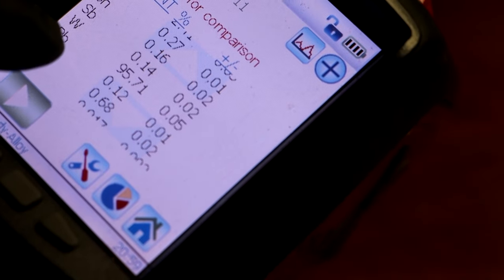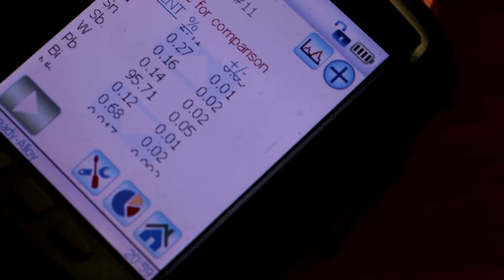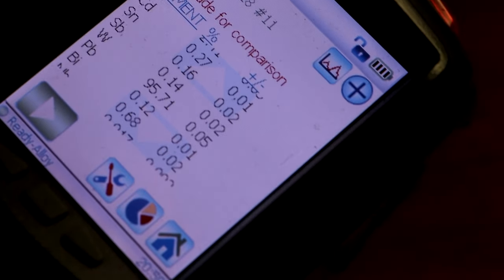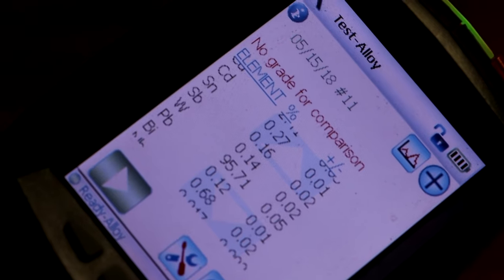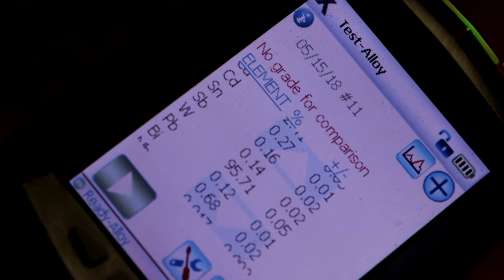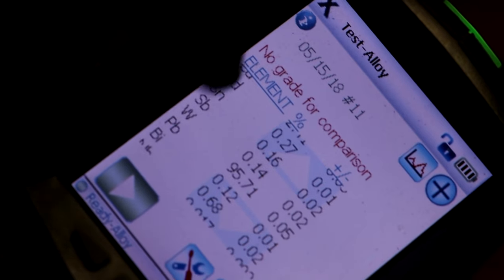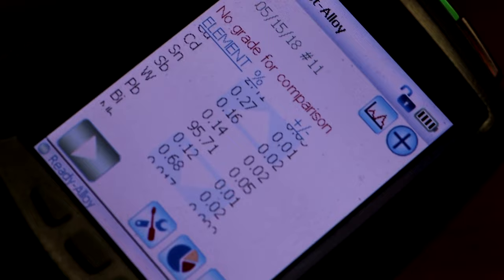Anyway, you might notice that the gold is showing up under W for tungsten. That is just a software thing. That's not actually a hardware issue. Under this mode, gold just shows up as tungsten because that's the closest the software can read the peak as. Gold isn't one of the elements it has loaded for this mode here. I'll probably do a video on that at some point.